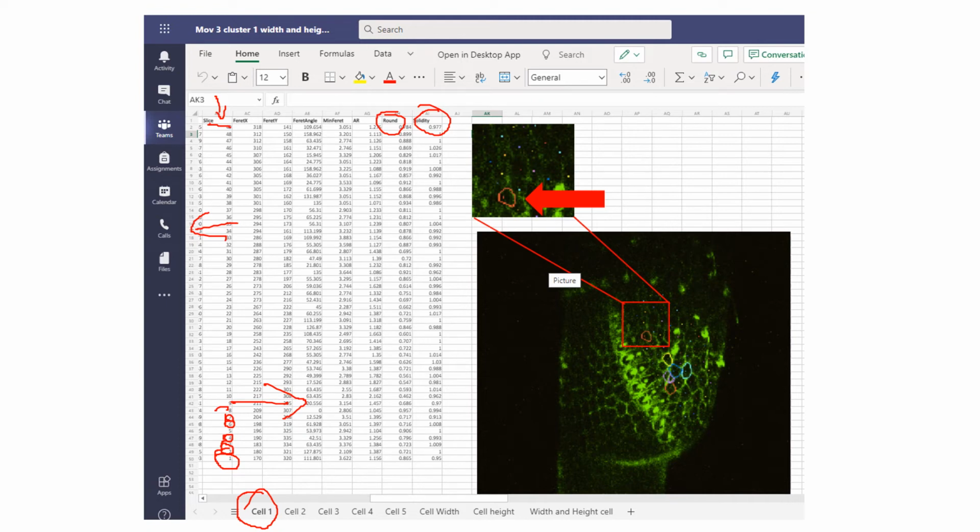But what I wanted to show you is that here, for example, we show you which cell cell 1 is, this cell that is here, and how it looks. In case you want to see the movie, you can analyze how the cell was moving, and if you have any hypothesis that you want to test, you can analyze it and see the real cell, not only the data.